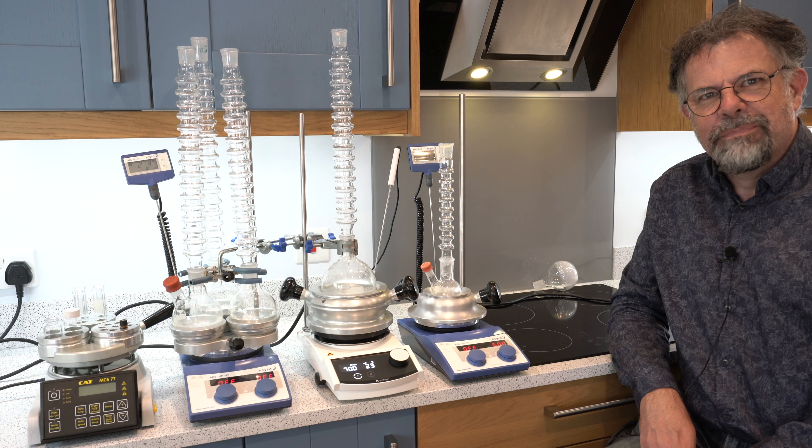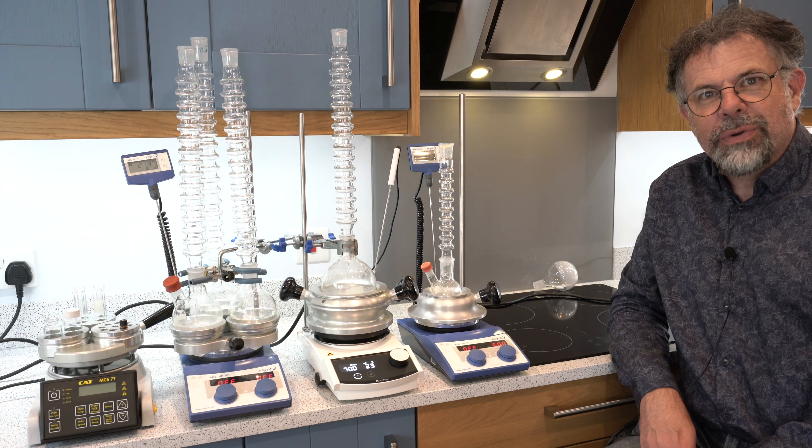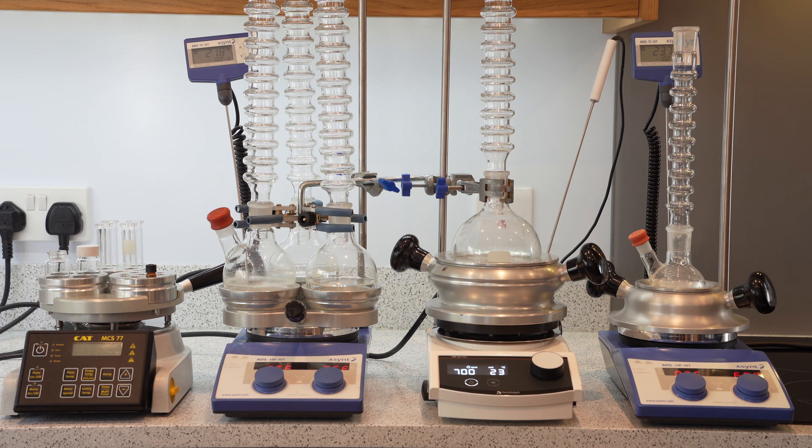Welcome to Asynt. My name's Martin Fordham and today I'd like to introduce you to the DrySyn range of laboratory heating blocks for round bottom flasks in the synthesis laboratory.